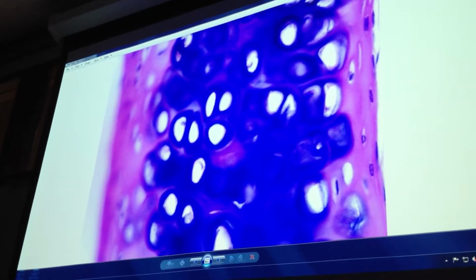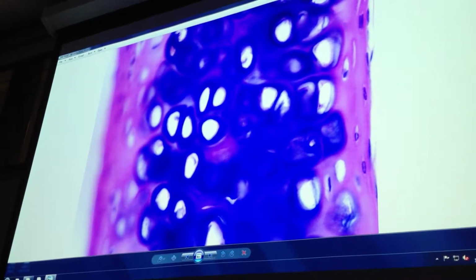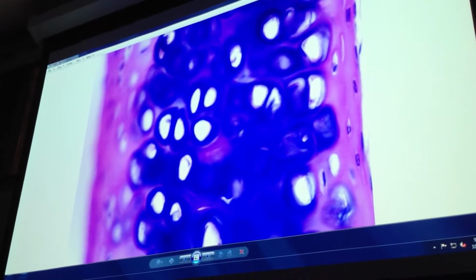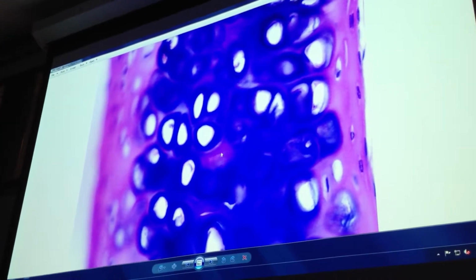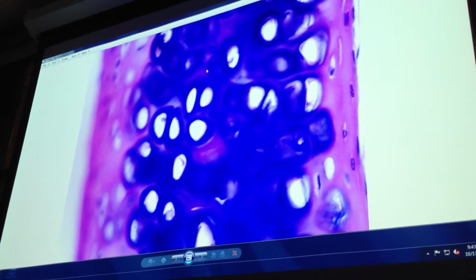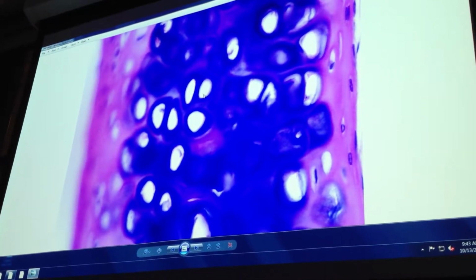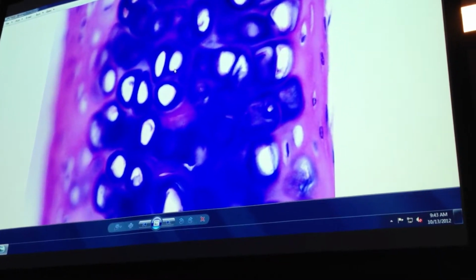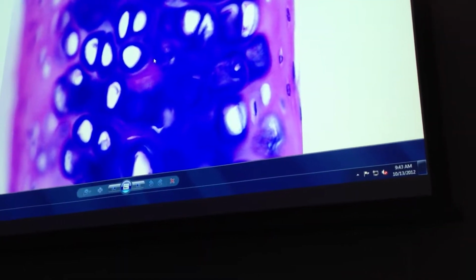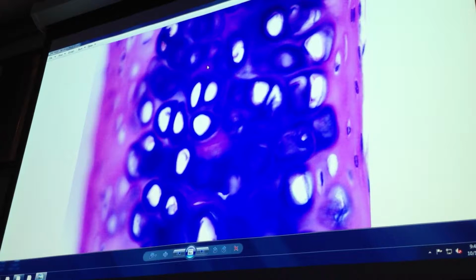No, this is a connective tissue, sorry. Thought we were done with them, but we're not. Okay. Name 2 words that name that connective tissue. And notice in here, in the non-living matrix, you don't see any fibers. What's this? Is that a lacuna? Okay. No fibers. It's clear. Hyaline cartilage. Non-living matrix is chondroitin.